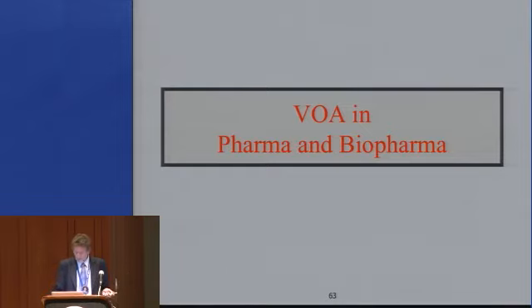So let's go on and do applications. VOA in pharma and biopharma.